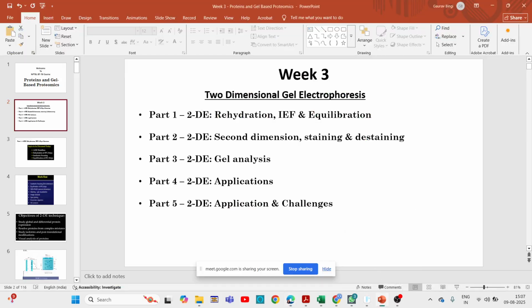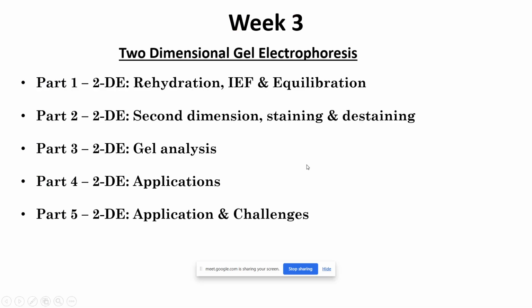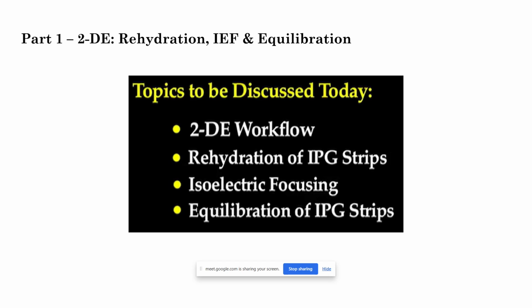So it's easy, as we are talking about only one specific experiment or technique by which we can do proteomics, gel-based proteomic analysis. In the first lecture, Sir talked about rehydration, isoelectric focusing, and equilibration. These are the topics he discussed.